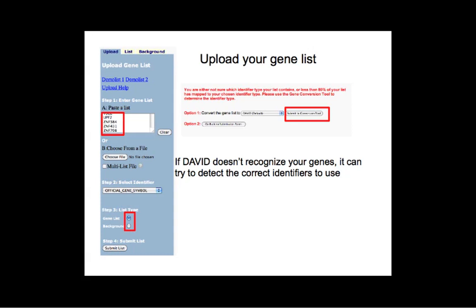It's important to select the correct list type — gene list versus background list. You can upload a background gene list separately. David will ask you to select an identifier. In this case, the gene names are official Hugo gene symbols, so I can choose 'official gene symbol.' If you don't know your identifier, you can select 'don't know' and DAVID will try to detect the correct identifier. However, if you let DAVID guess, it converts everything to its own internal identifier, and when you download results, you get the DAVID internal identifier rather than your original identifiers.